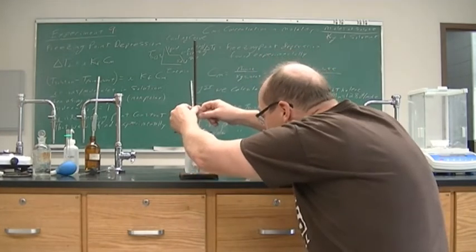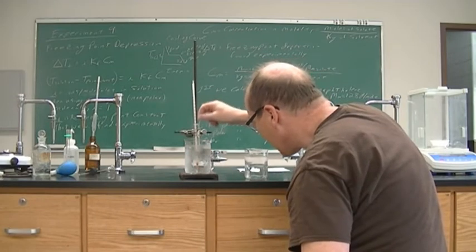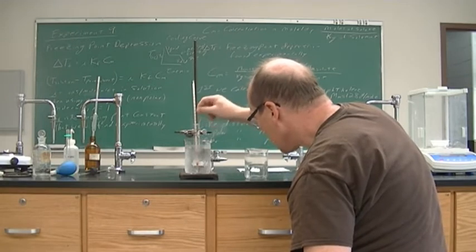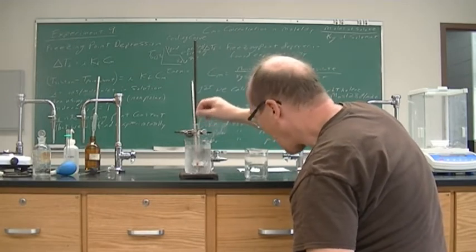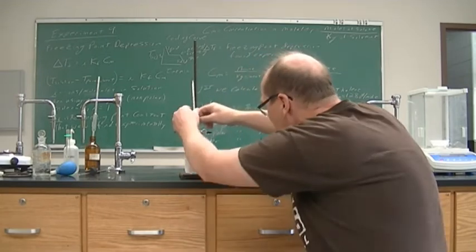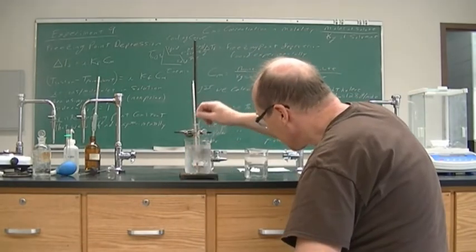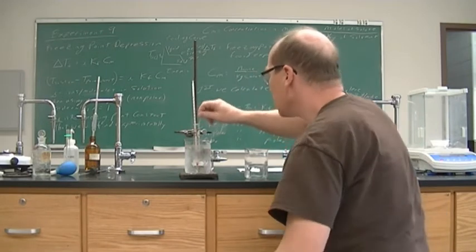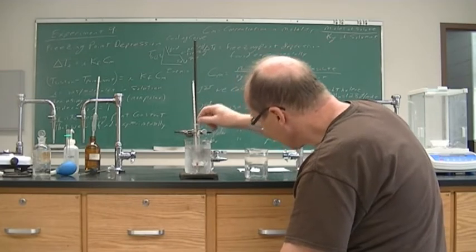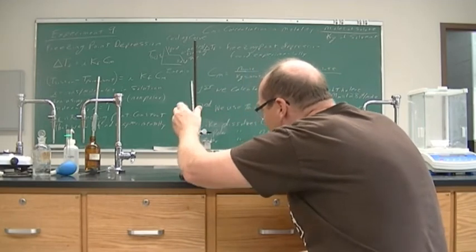Now it's at 3.2 and still no solid forming. It's down to 3. And it is 2.9.